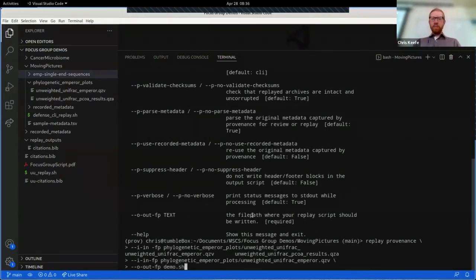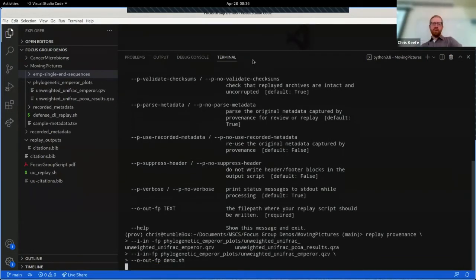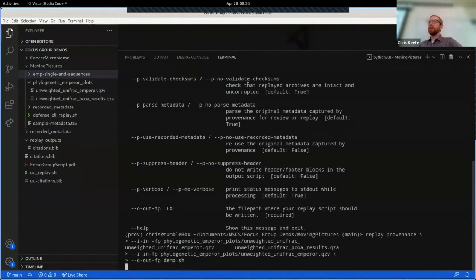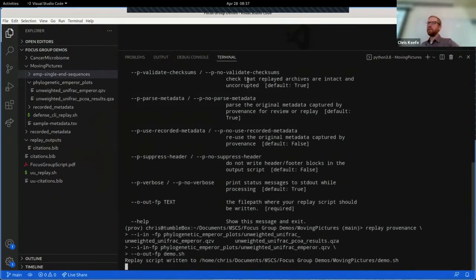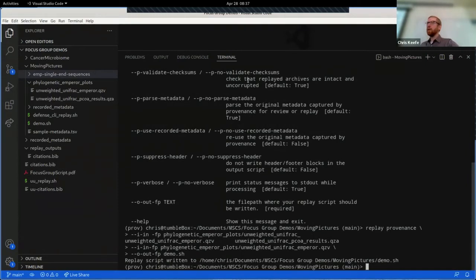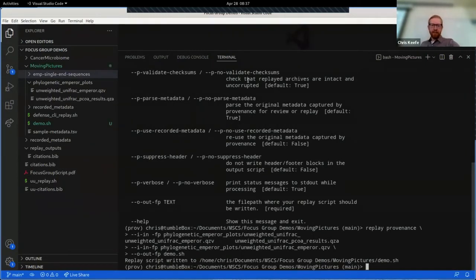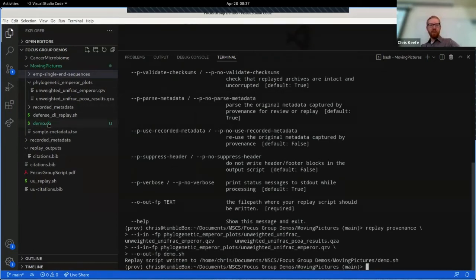And this is by default going to produce a script for the command line interface of QIIME 2. You can easily change it to produce a script for the Python interface, the Python API, and that software is set up to easily extend to target additional interfaces, graphical interfaces, hopefully in the near future, Jupyter notebooks as well. And you can see that it's already parsed this thing and created this new file on the left called demo.sh.